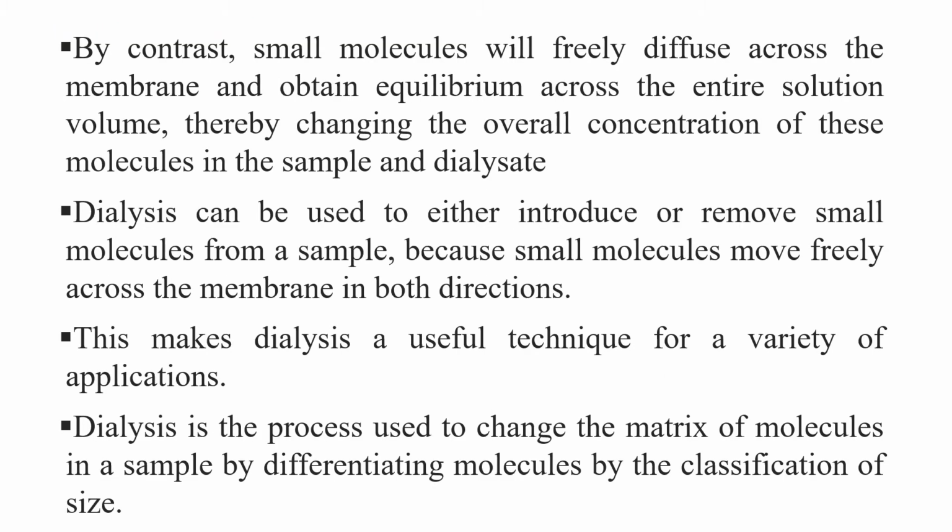By contrast, small molecules will freely diffuse across the membrane and reach equilibrium across the entire solution volume, thereby changing the overall concentration of these molecules in the sample and the dialysate. Dialysis can be used to either introduce or remove small molecules from a sample, because small molecules move freely across the membrane in both directions. This makes dialysis a useful technique for a variety of applications, and it is a process used to change the matrix of molecules in a sample by differentiating molecules by size.